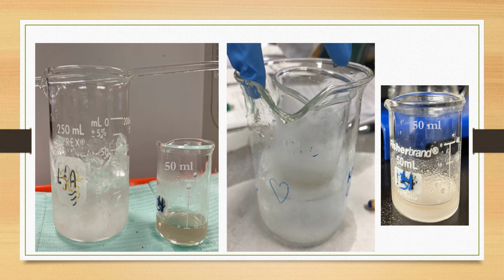Scratch the inside of the beaker with a clean glass stirring rod if necessary to induce and speed up the crystallization.